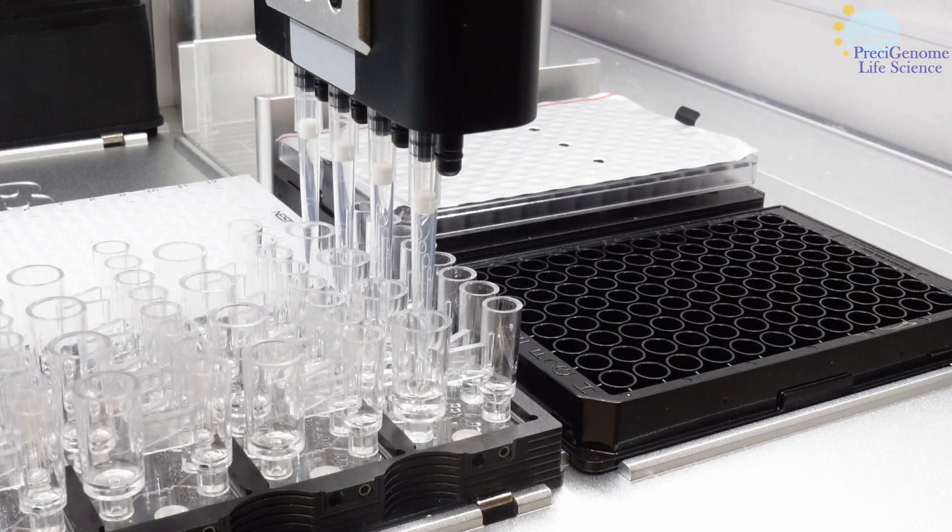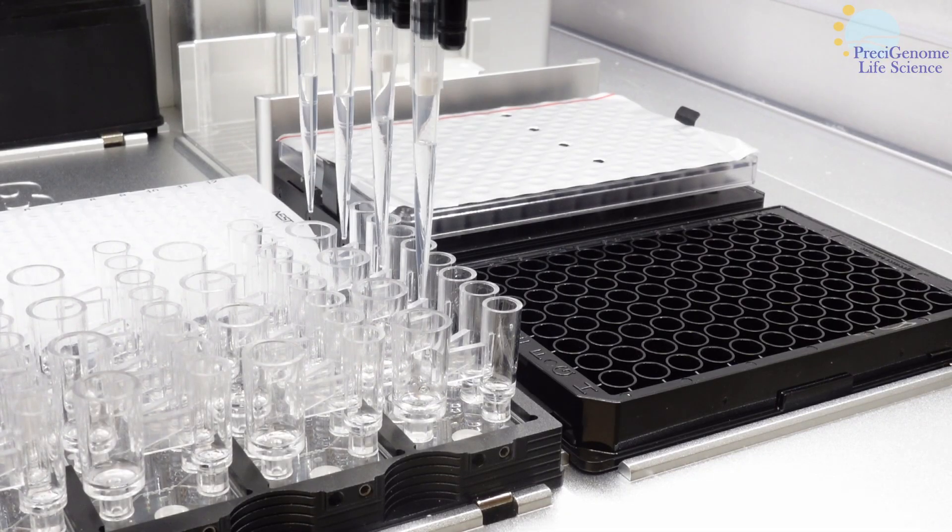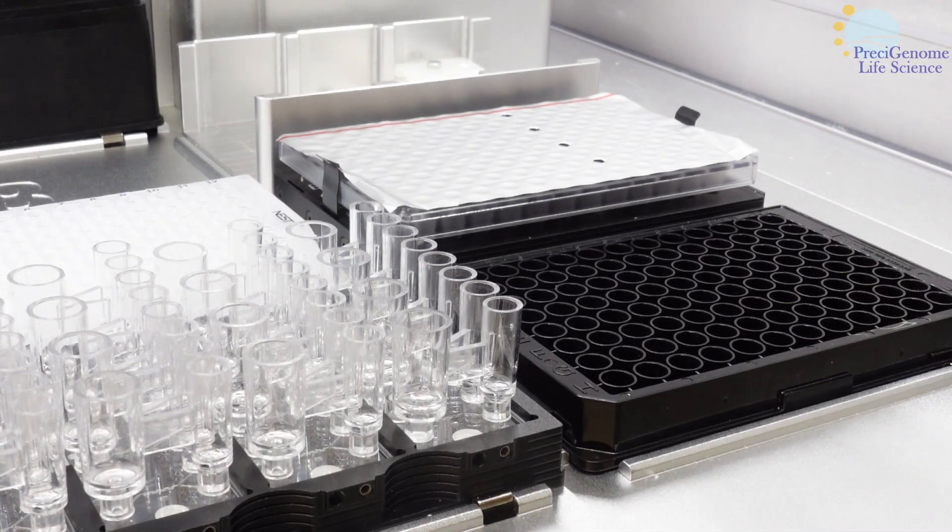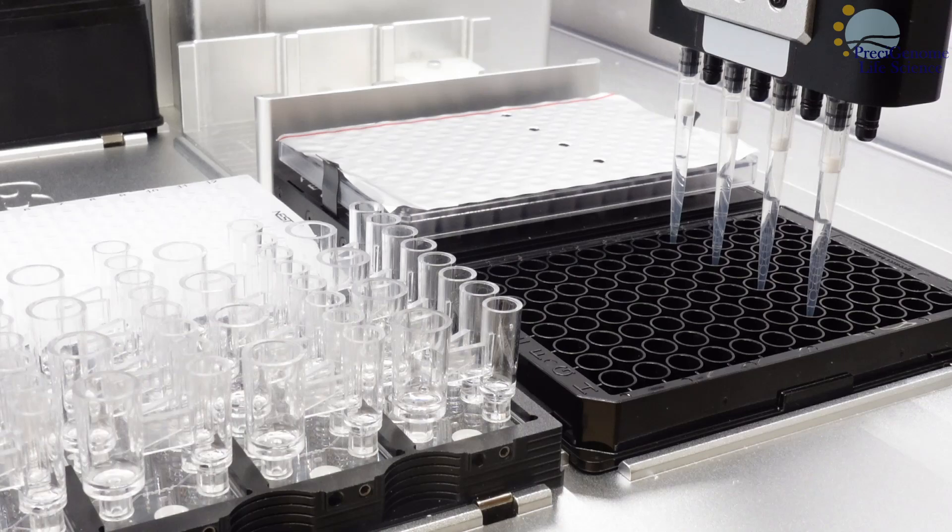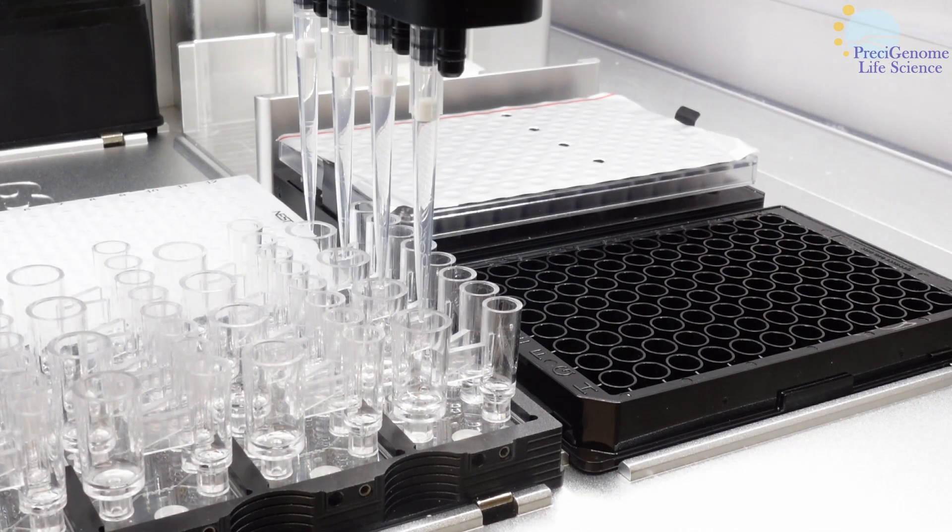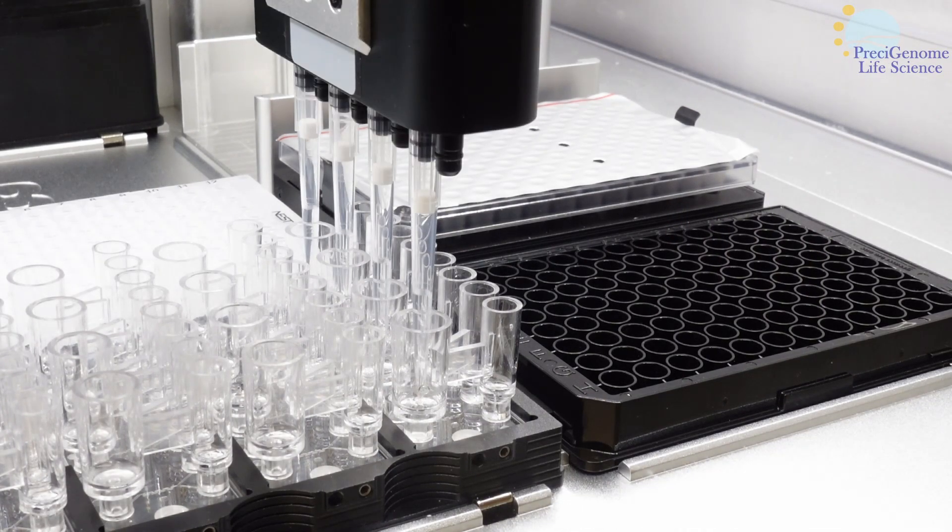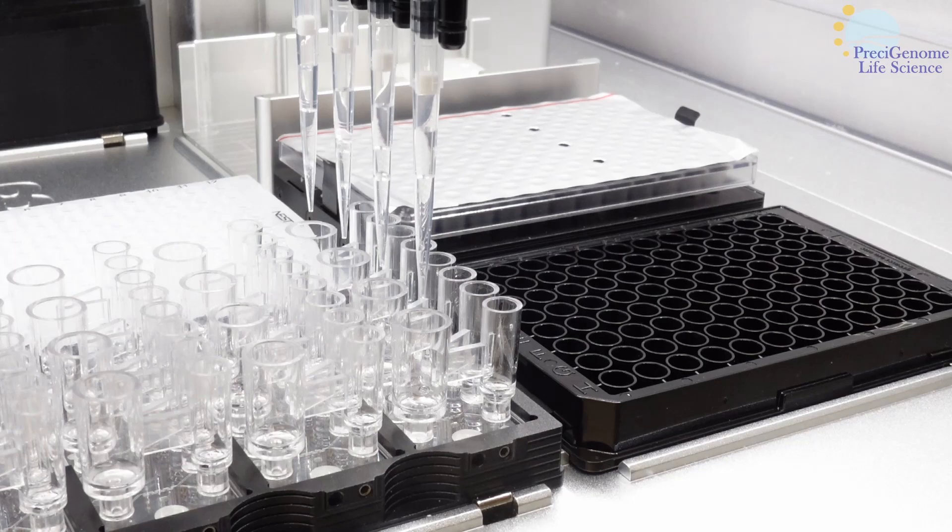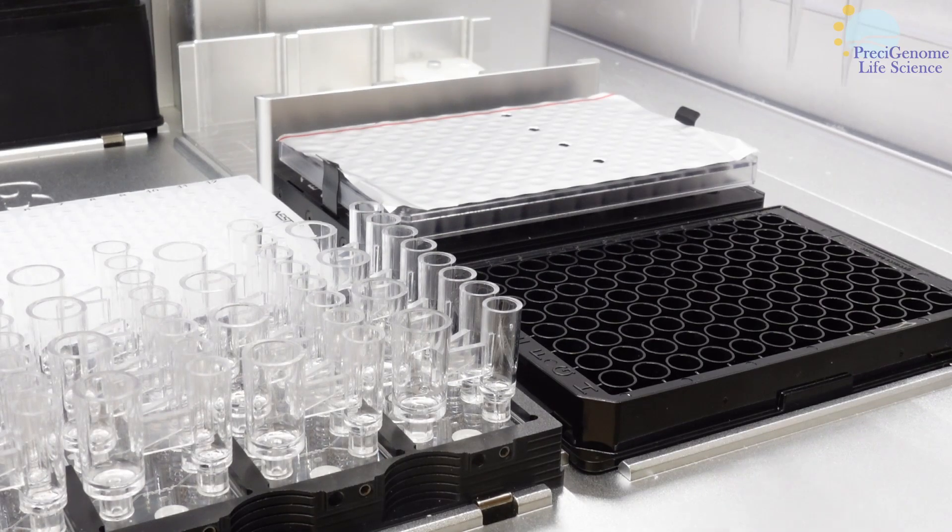All these features make for a convenient screening workflow. Users only need to prepare the initial reagents and consumables before the machine automates the rest.